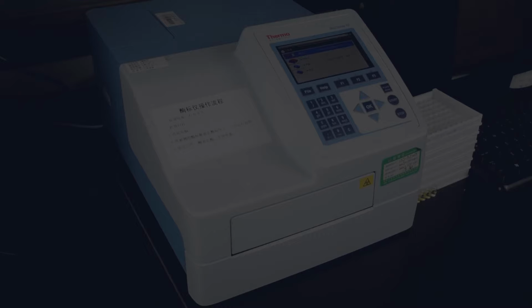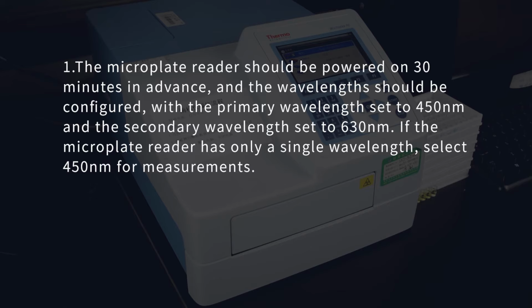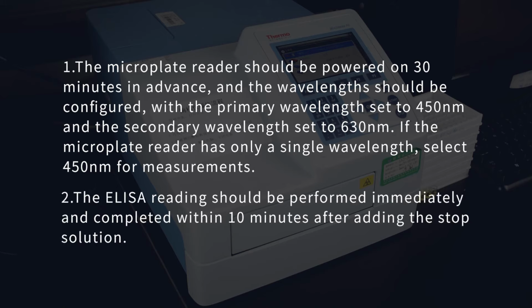ELISA reading. The ELISA reading is the process of presenting the entire test results through data interpretation. When taking readings, 2 points should be noted. 1. The microplate reader should be powered on 30 minutes in advance, and the wavelengths should be configured, with the primary wavelength set to 450 nanometers and the secondary wavelength set to 630 nanometers. If the microplate reader has only a single wavelength, select 450 nanometers for measurements. 2. The ELISA reading should be performed immediately and completed within 10 minutes after adding the stop solution.